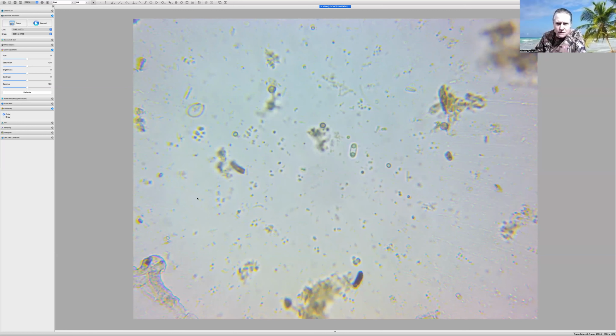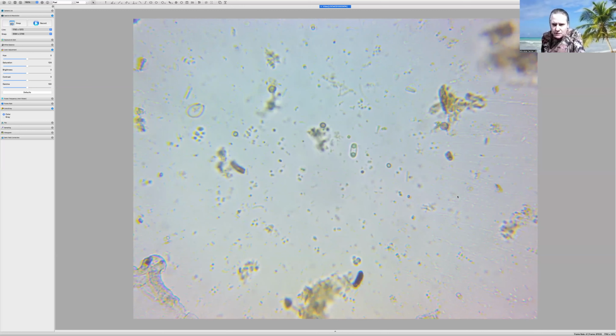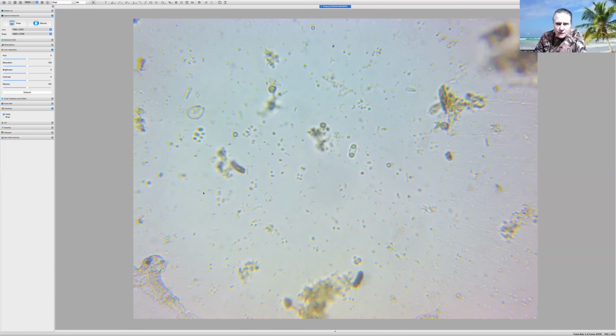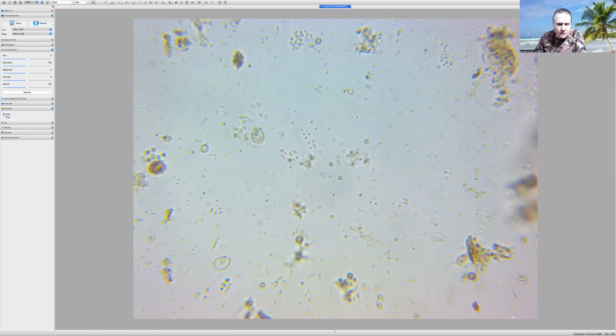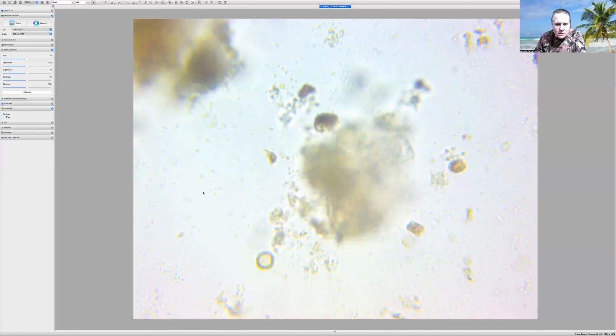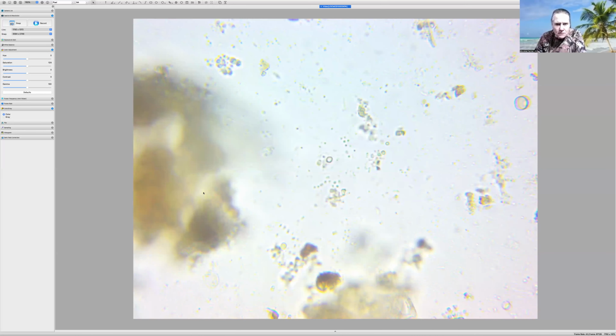I wanted to try to find you. Oh gosh, there's just flagellates everywhere. There's a flagellate here, there's a flagellate here. I'm trying not to count the same ones over again, but there's flagellates here. So I'm going to need to add another biostimulant to keep them going strong. I wanted to see if I could find you a rotifer or a stalk ciliate doing its job, moving things around here in the soil. We had quite a few of them, and they're usually hanging out on these particles.